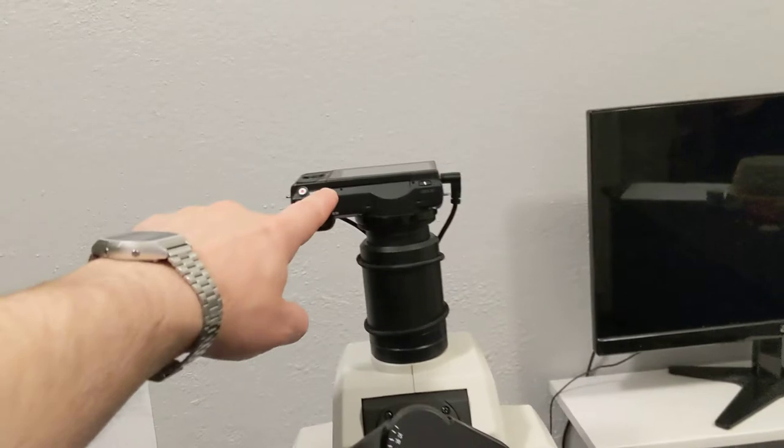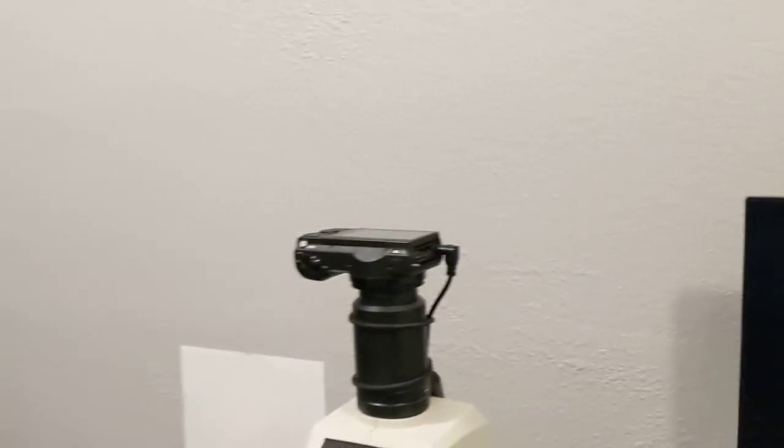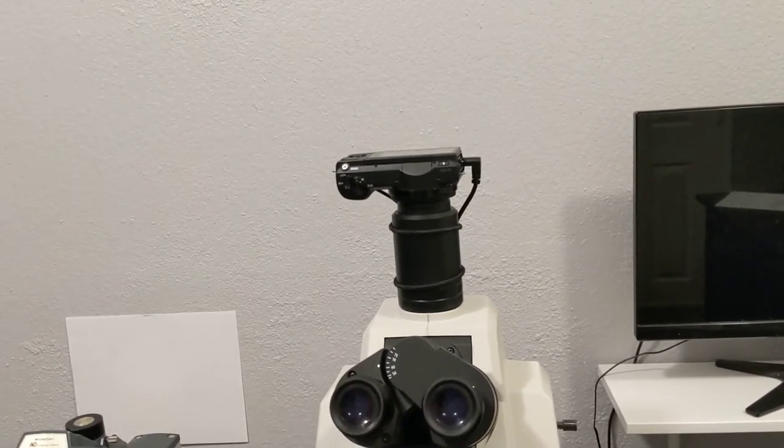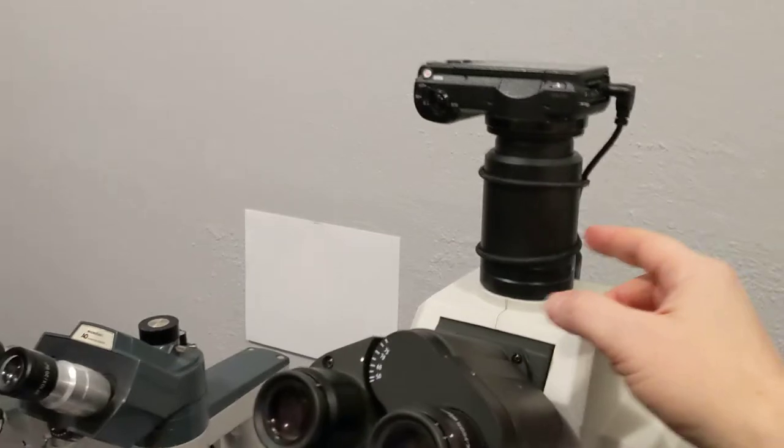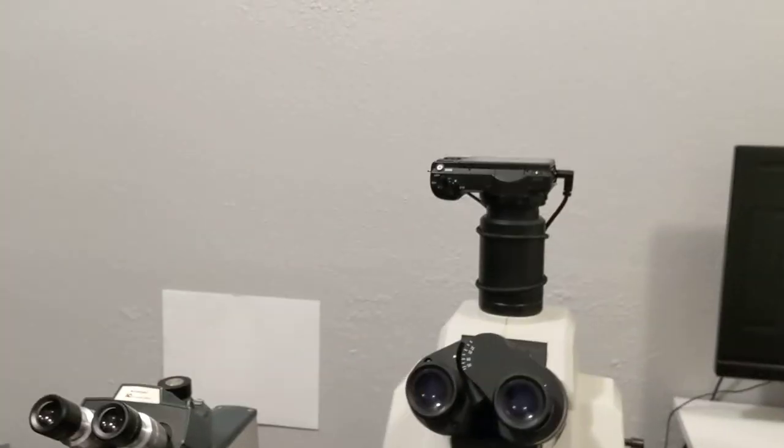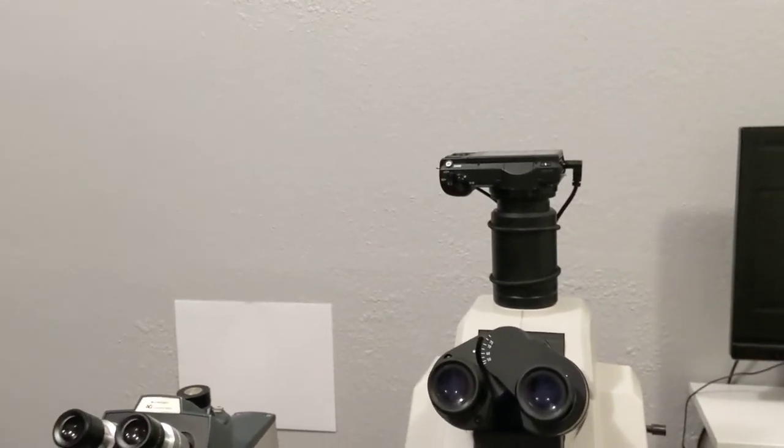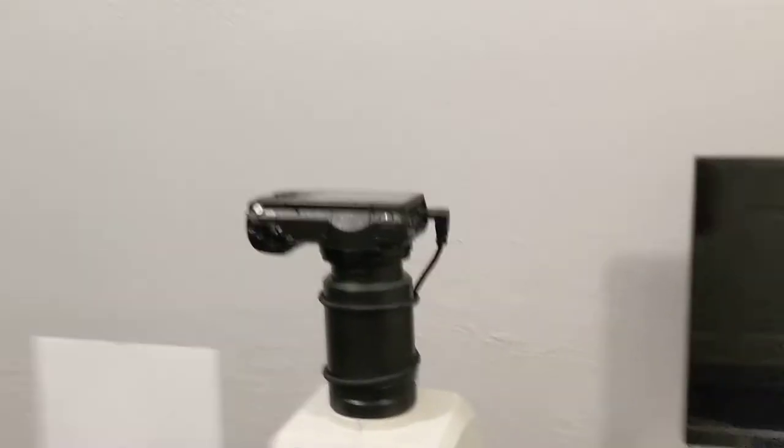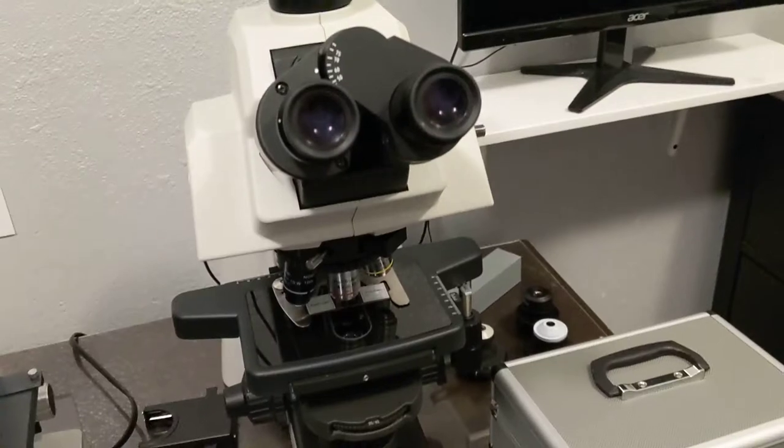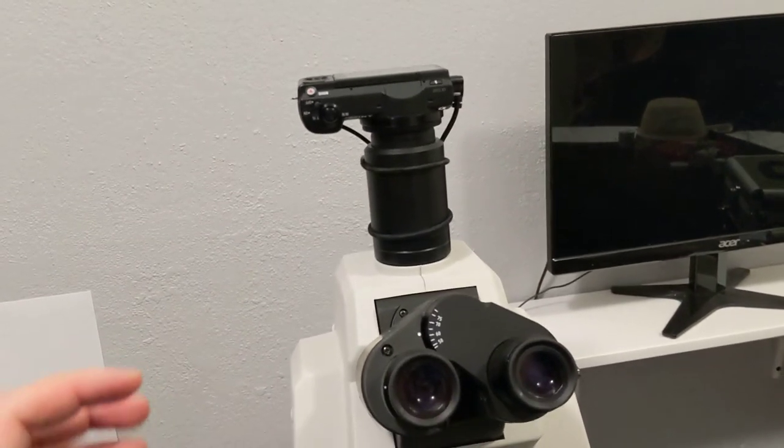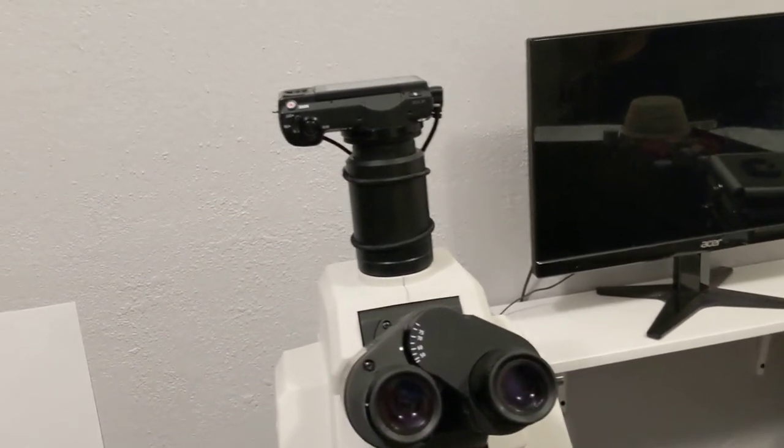This is just a Sony DSLR A5100. They made Nikon and Canon adapters with lenses in them. But since my camera's a Sony, I didn't buy them. I did buy a C-mount, and I had one of those eBay $10 C to E adapters, no glass in it. I screwed this camera on there, and lo and behold, it's parfocal. It's like an eighth of a turn off, but it's very workable.